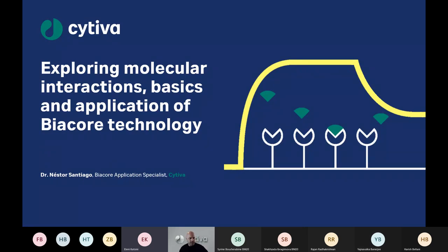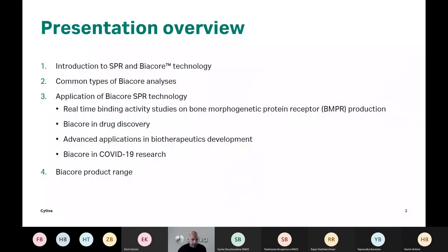Okay, so I will tell you a little bit about Biacore and the technology behind the systems that is, as you know, based in SPR, surface plasmon resonance principle. And so we'll go through, first of all, the introduction of the technology, SPR technology and Biacore technology.